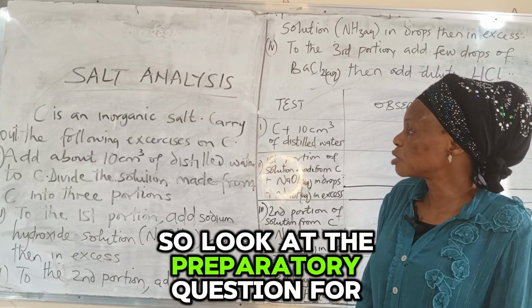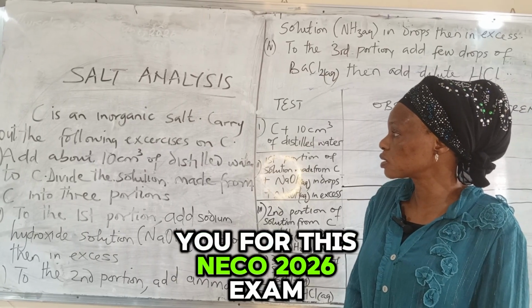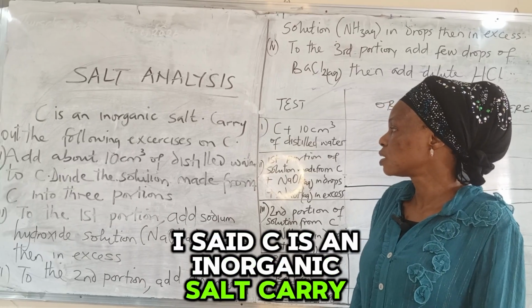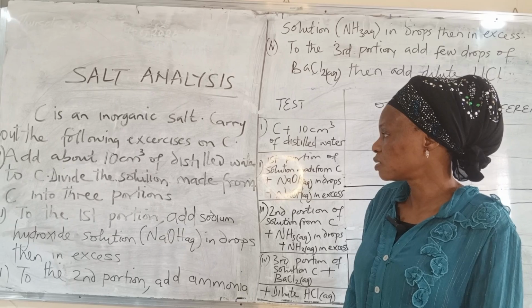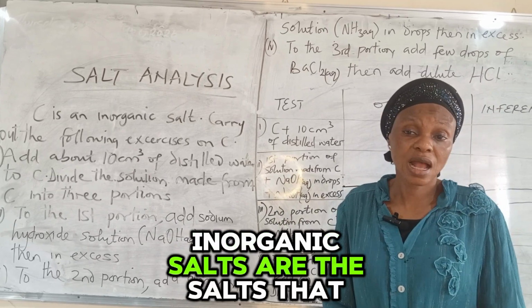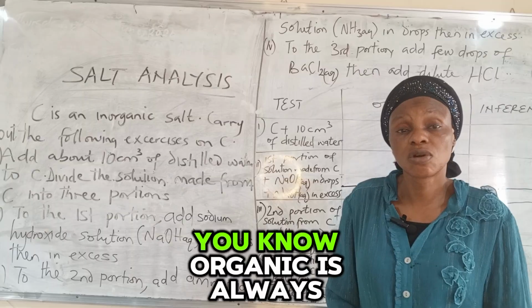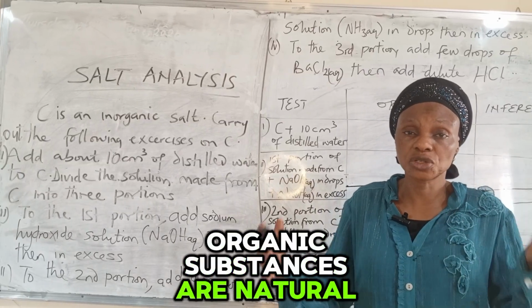So look at the preparatory question for you for this NECO 2026 exam. It says C is an inorganic salt. Carry out the following exercises on C. Inorganic salts are the salts that are not organic. Organic substances are natural substances.